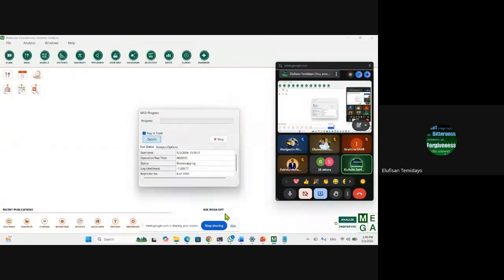Now you will notice that this one is very slow. You see it's counting. The replicate is counting. It is more rigorous statistically, so it takes time. So if you want something that you just want to show to your supervisor quickly, or present at a conference, you can quickly use neighbor joining. But if you want to really be sure of what you have, the best thing to work with is maximum likelihood. Okay, so let's see this as it works.